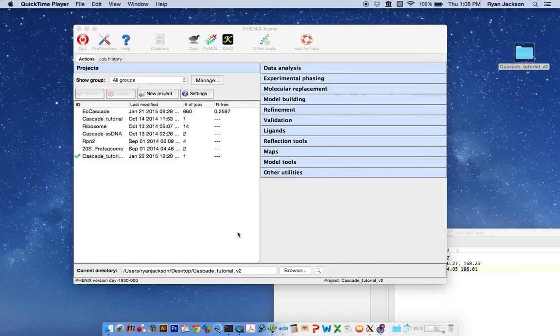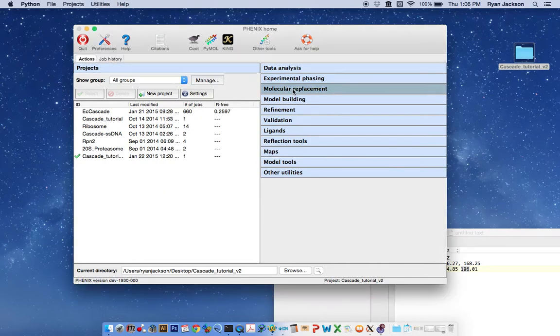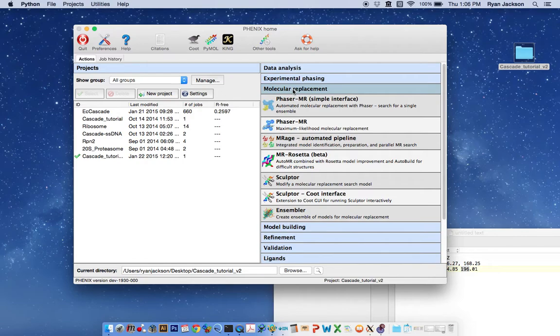To do this we need high-resolution X-ray data and a prepared EM map that we did in tutorial number 1. The first thing we do is go to the molecular replacement tab. You want to go to phaser MR.